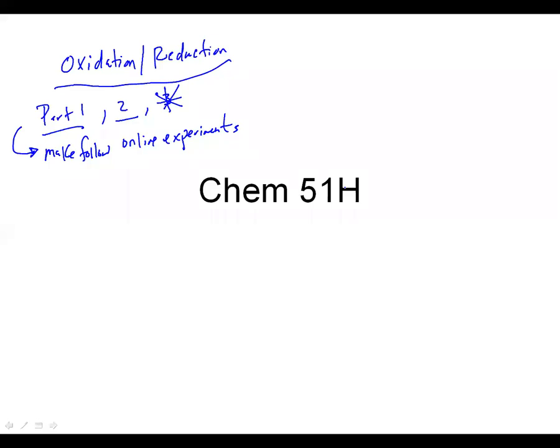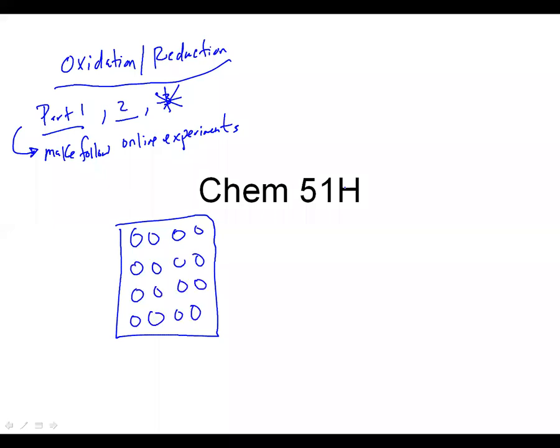I think they had copper, zinc, and magnesium. And basically, you're going to take the spot plate and do a number of reactions with it. For example, HCl, I think zinc sulfate, and so forth, magnesium nitrate, and there are a few others as well. When you look at it, you'll be able to see it.